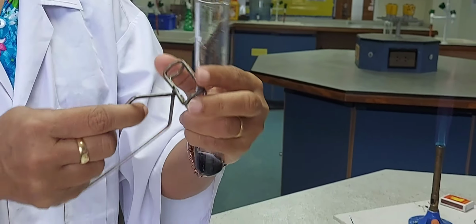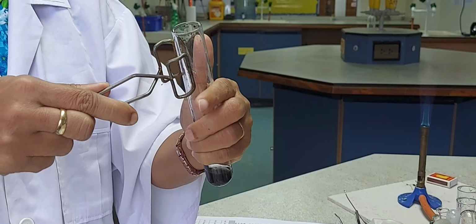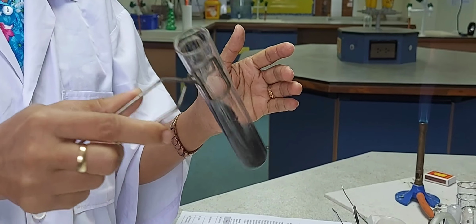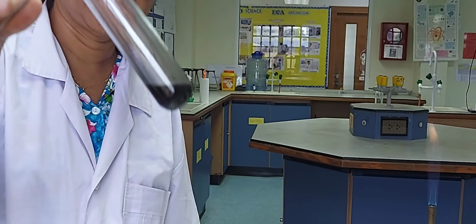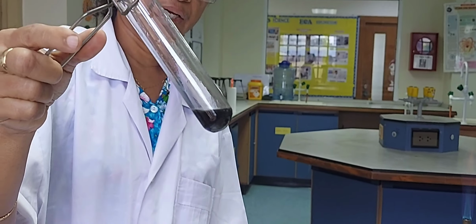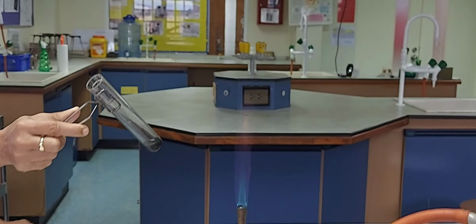No obvious reaction at this time. It's just like dissolving it in the water, you can see a dark black color. So let's heat and see whether a reaction is happening.